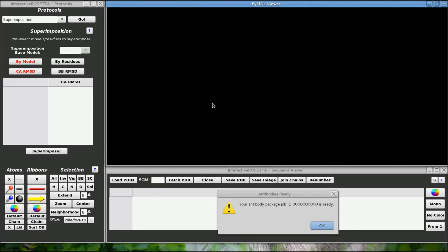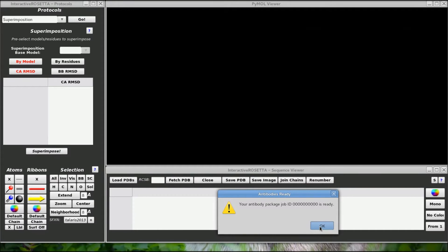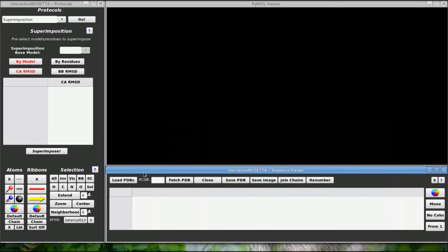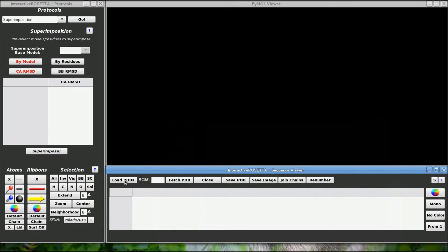Okay, looks like our antibody job is all finished. Let's download that when prompted. So you'll see that I got 10 antibody models like I requested earlier.